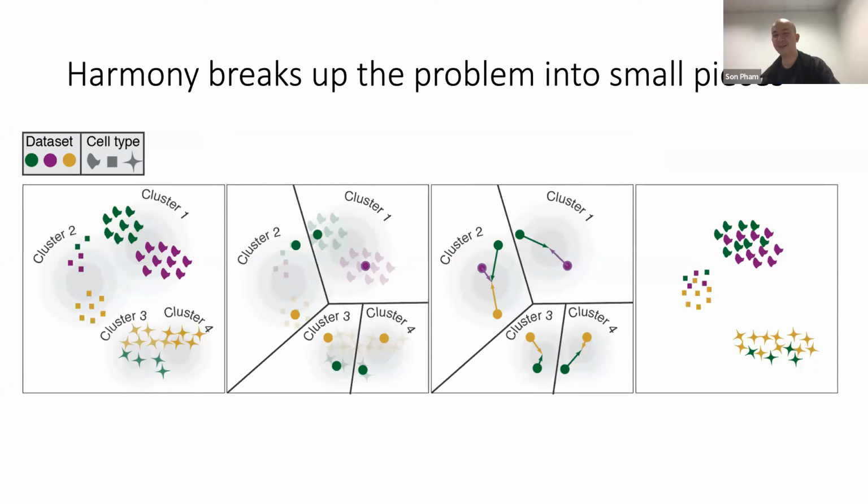Thanks, Ilya. The next question, I think from a wet lab biologist, Elisa Rosati: if I want to correct for multiple batch effects that are partially correlated, is it a problem? For example, I have 6 samples prepared on 3 different days. 4 of them were sequenced together and 2 not. What is the best correction strategy? Correct for both sequencing run and experimental day?